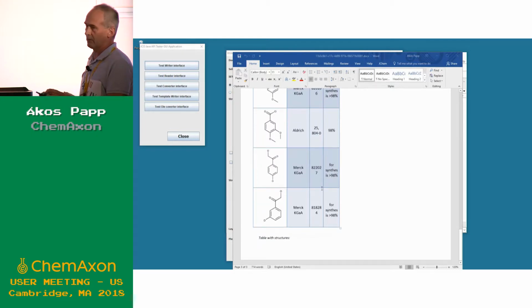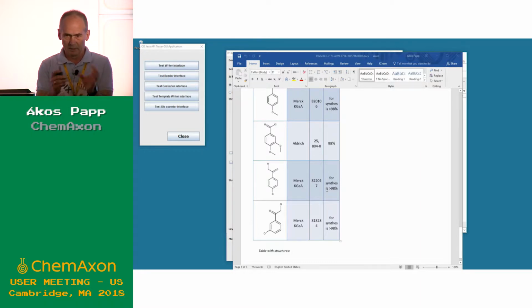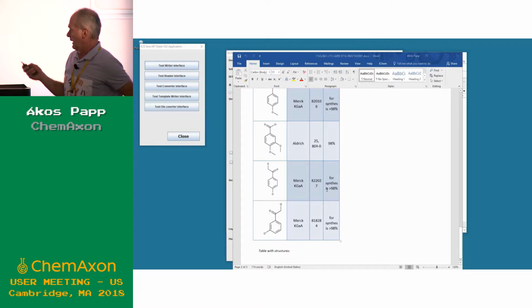Okay, if any one of you is interested in this, and it now rang a bell, then I'm happy to give further explanation. And I even took a zip package with me that does exactly this, which is in the video. And if somebody's interested, I can give it or send it and you can see the code. It's basically twice three lines, which does it using this API. Okay, and let's move on.